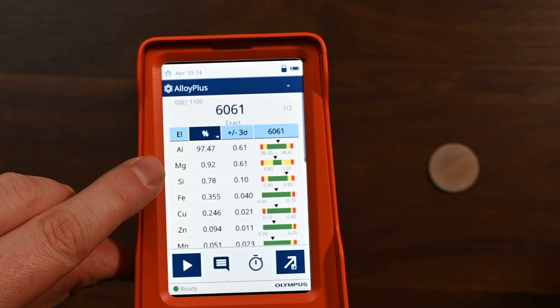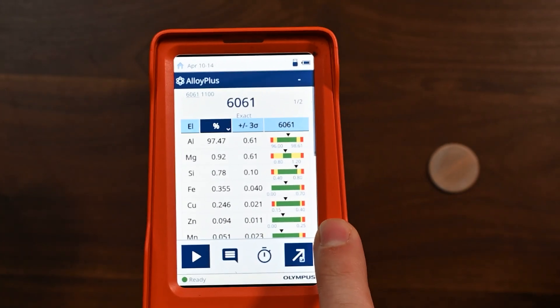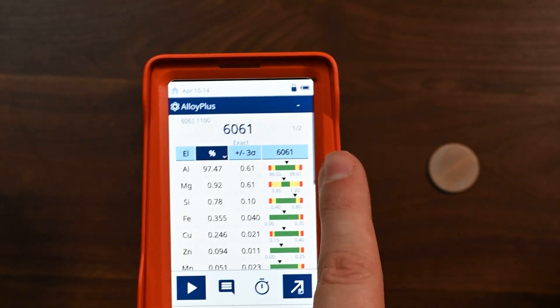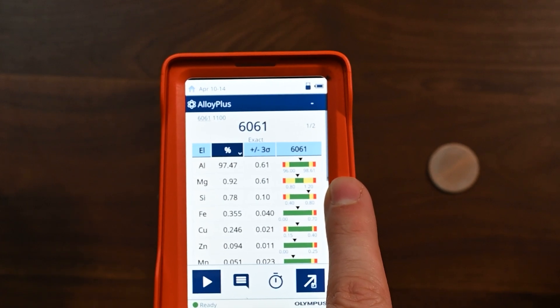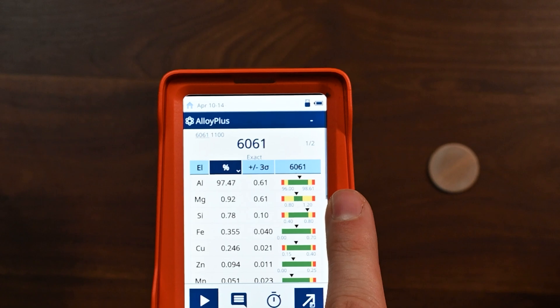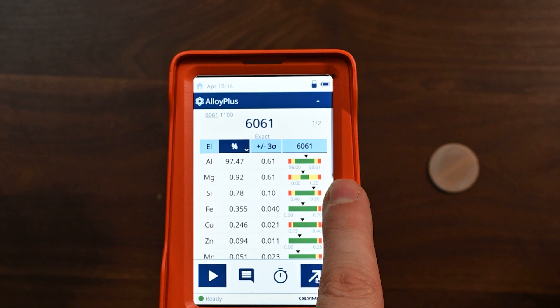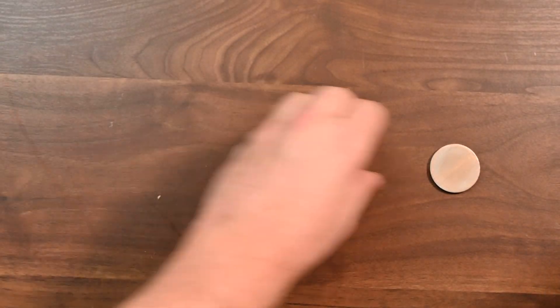You'll also see that we were able to nail things like magnesium and silicon — the light elements. The colorful chemical analysis window tells you how close you are in or out of spec. Things like magnesium that have a little less precision on any handheld XRF analyzer have broader error bars. The yellow ranges for magnesium are bigger than they are for something like zinc or iron, but that's just standard par for the course.